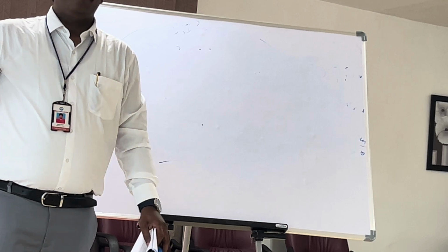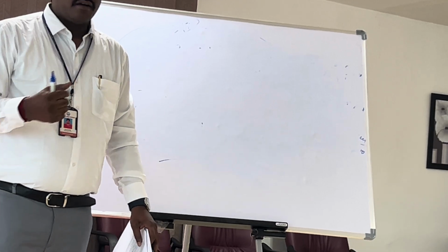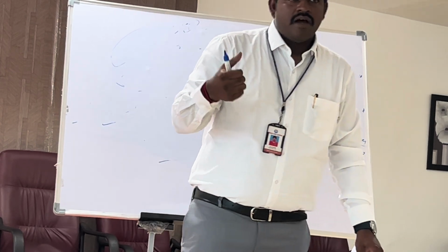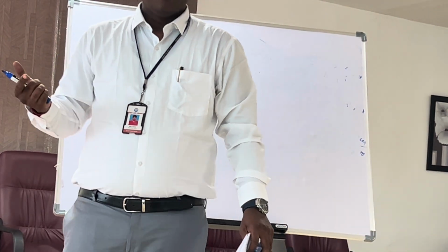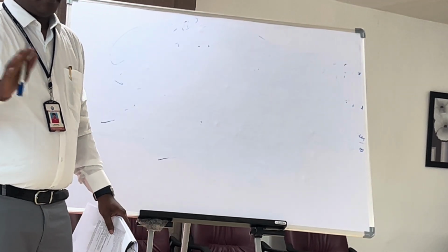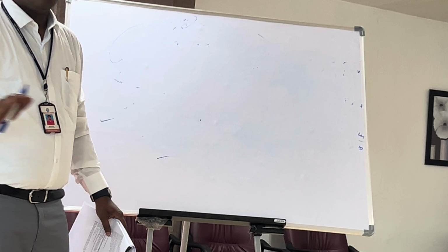So dissolution is a very important technique. In dissolution, the most commonly used types are immediate release and controlled release. These two are very frequent and commonly used techniques. For immediate release, you don't need to do anything special; the calculation is also in a similar way.